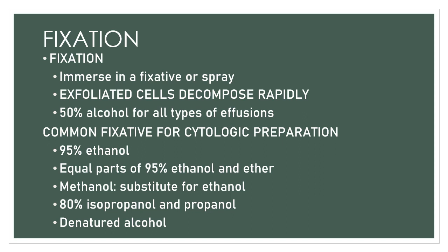Your common fixative for cytologic preparation is 95% ethanol. The fixation time varies accordingly, but for 95% ethanol you have 3 to 5 minutes.